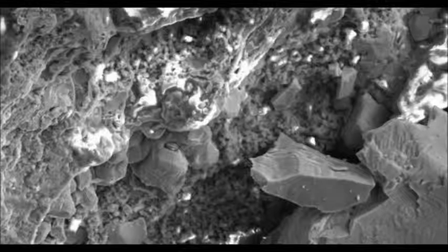The team was using a scanning electron microscope, which fires a beam of electrons focused onto a tiny part of a sample, scanning around to see how the electrons are deflected and thereby building up a detailed picture of the sample's nanometer-scale bumps and valleys. But that process causes the emission of a small amount of X-ray radiation, with the exact energy of the X-rays corresponding to the chemical element present in the focus of the electron beam. This is where a silicon drift detector comes in, harvesting these X-rays and determining their energy.